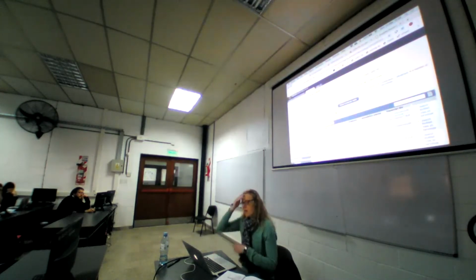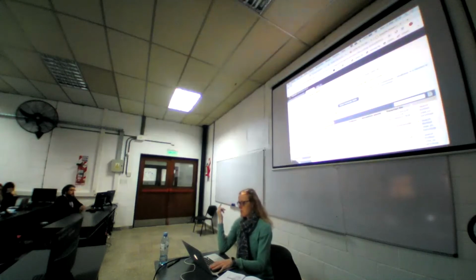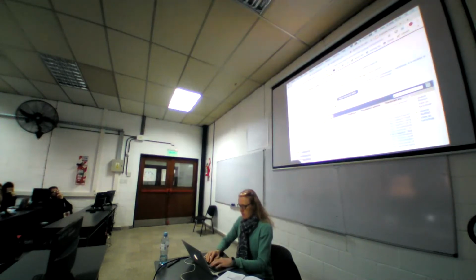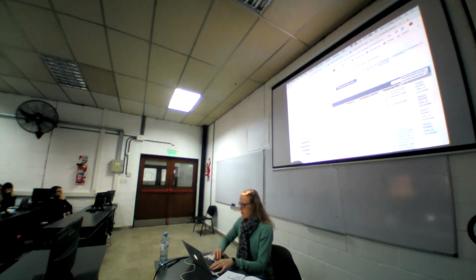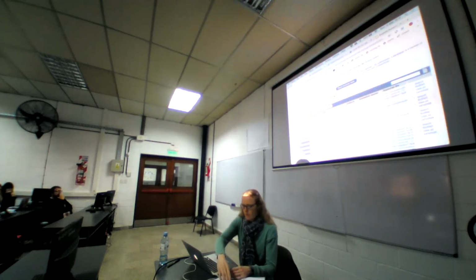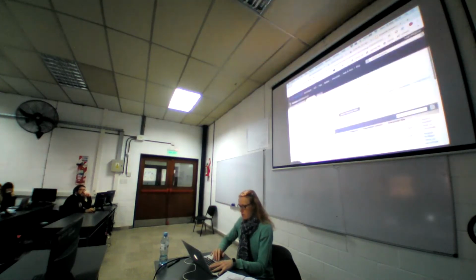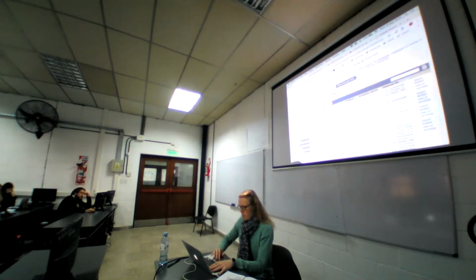And any of these tables, in fact, any table in Ensembl, you can filter by using the filter button at the top. So you can filter for something in this table, and likewise you can download it and open it in Excel using that button there. So now we know our gene is somehow related to locomotion.